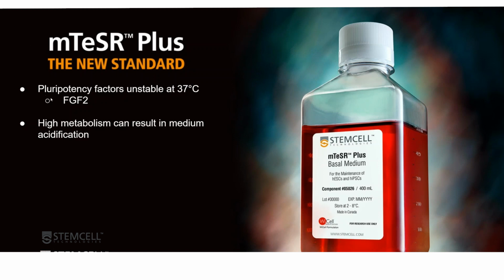One of the reasons why you need to feed pluripotent stem cells daily is because some of the key pluripotency factors are not very stable at 37 degrees, including FGF2. And so over time, at around 24 hours actually, there are usually very negligible levels of FGF2 left in the media. And so this is one of the reasons why you need to continually replenish the media.